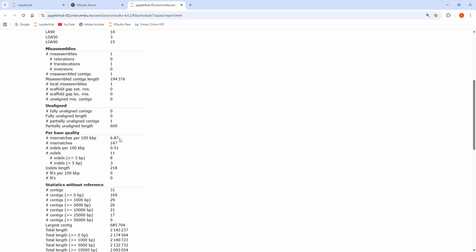When Quast aligns our contigs to the reference, it will not require 100% identical match. There is some substantial amount of mismatches which is allowed, and still Quast will say that the contig matched.